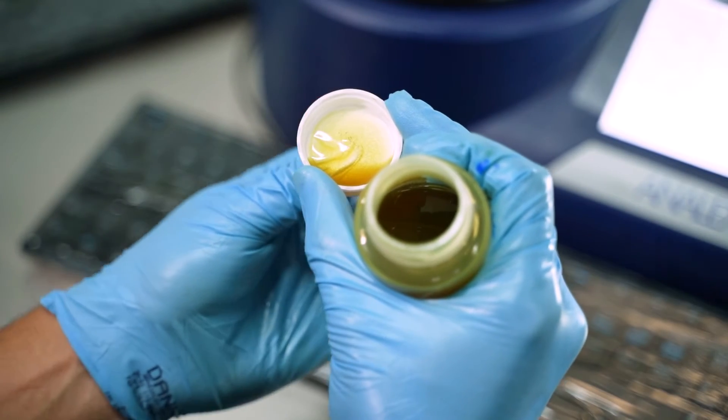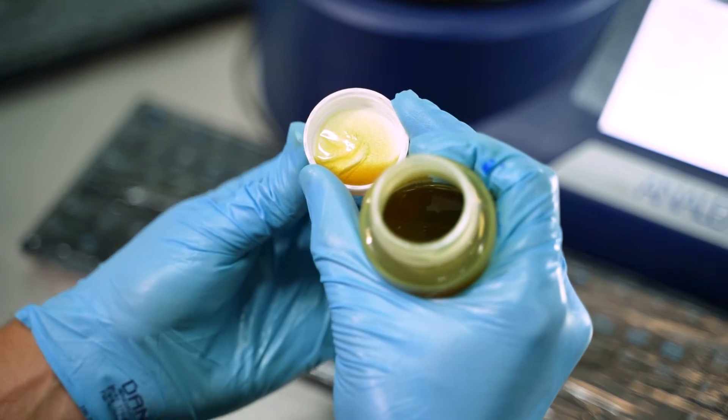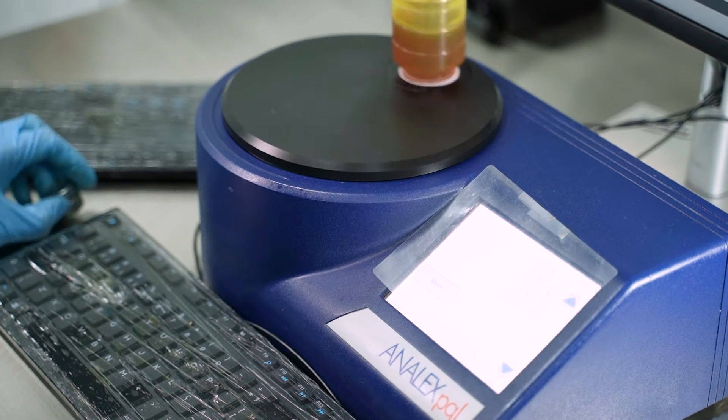Samples are sorted according to client program scope and equipment type to ensure processing efficiency and accuracy.